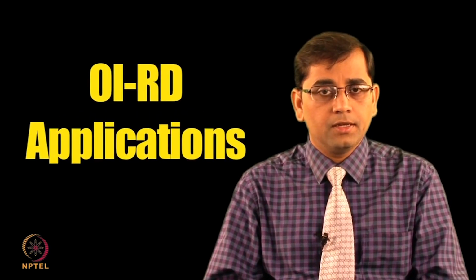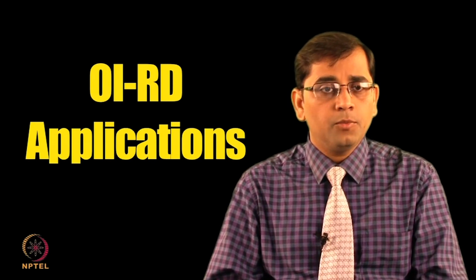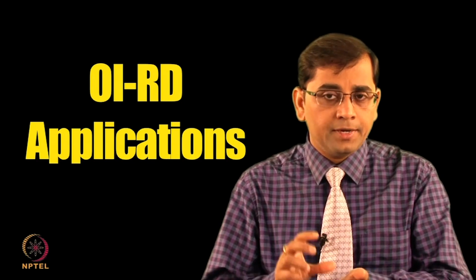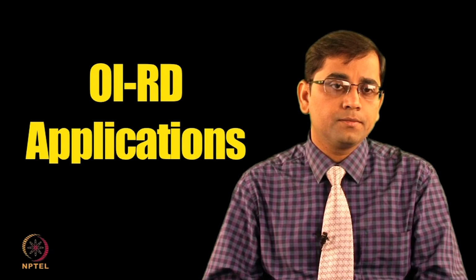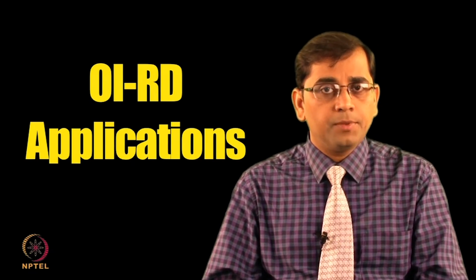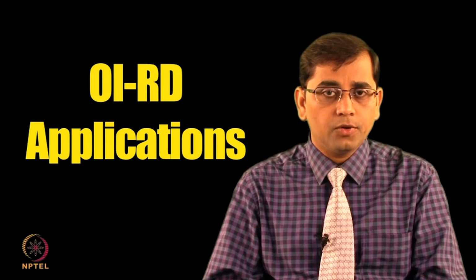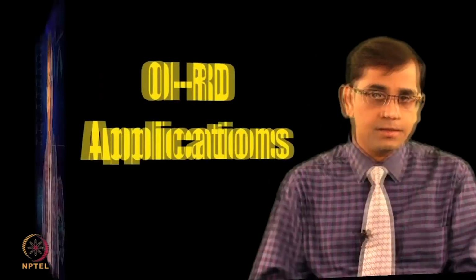OIRD has been used for various applications. The OIRD microscope has been applied for real-time monitoring of antigen-antibody interactions, nucleic acid hybridization and protein small molecule binding reactions. There are various applications of OIRD which makes it a good choice for label-free detection of proteins on microarrays.